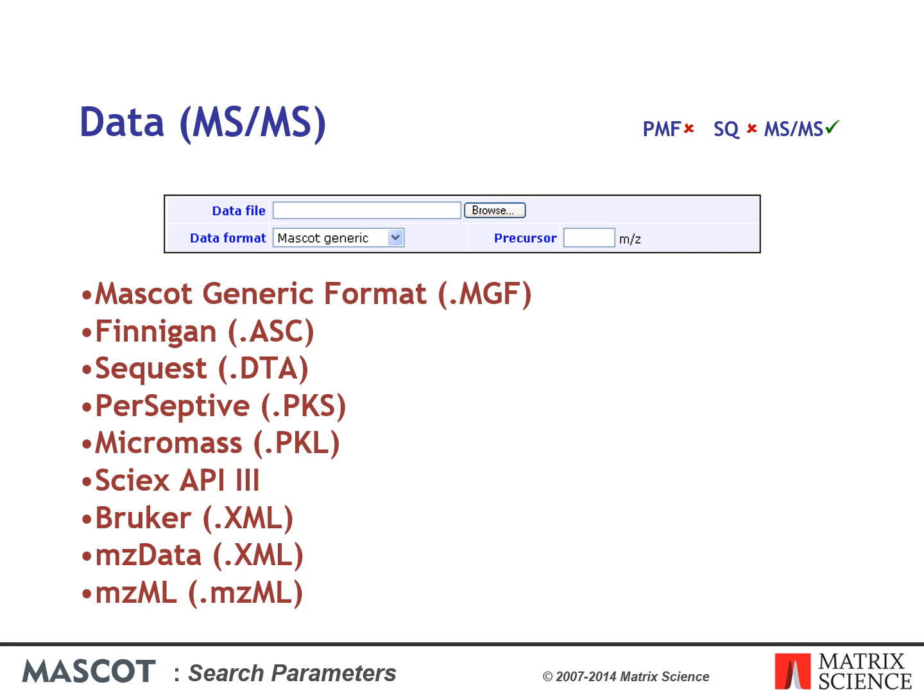If there is a conflict between the values of the embedded parameters and values entered into the search form fields, the embedded parameters always take precedence. The search form fields are essentially defaults for values missing from the data file.